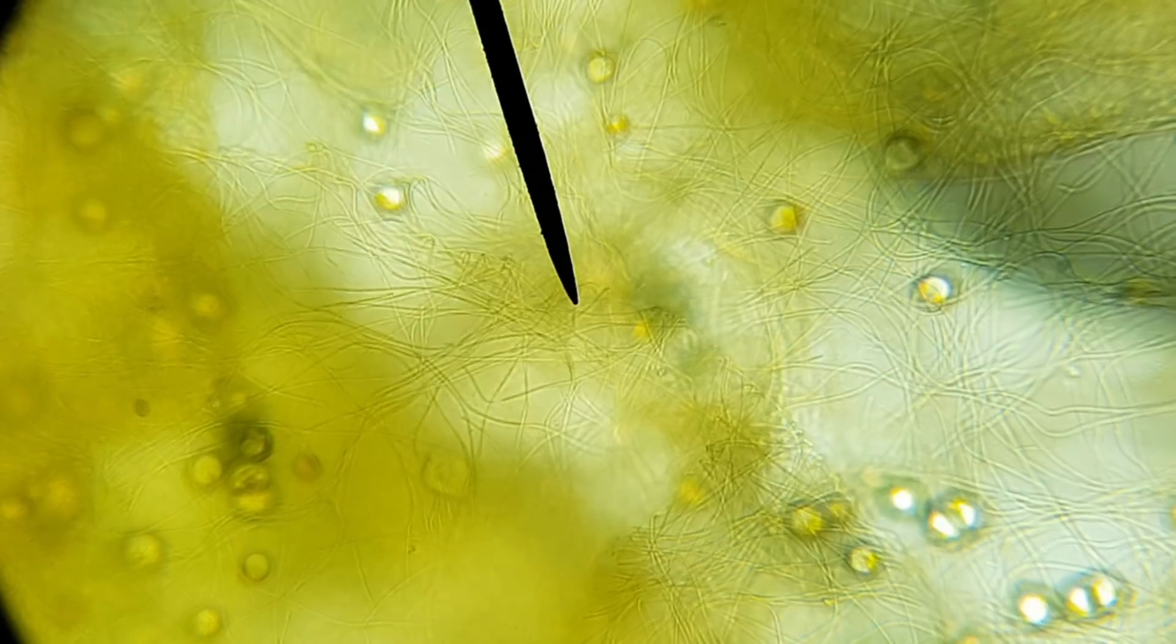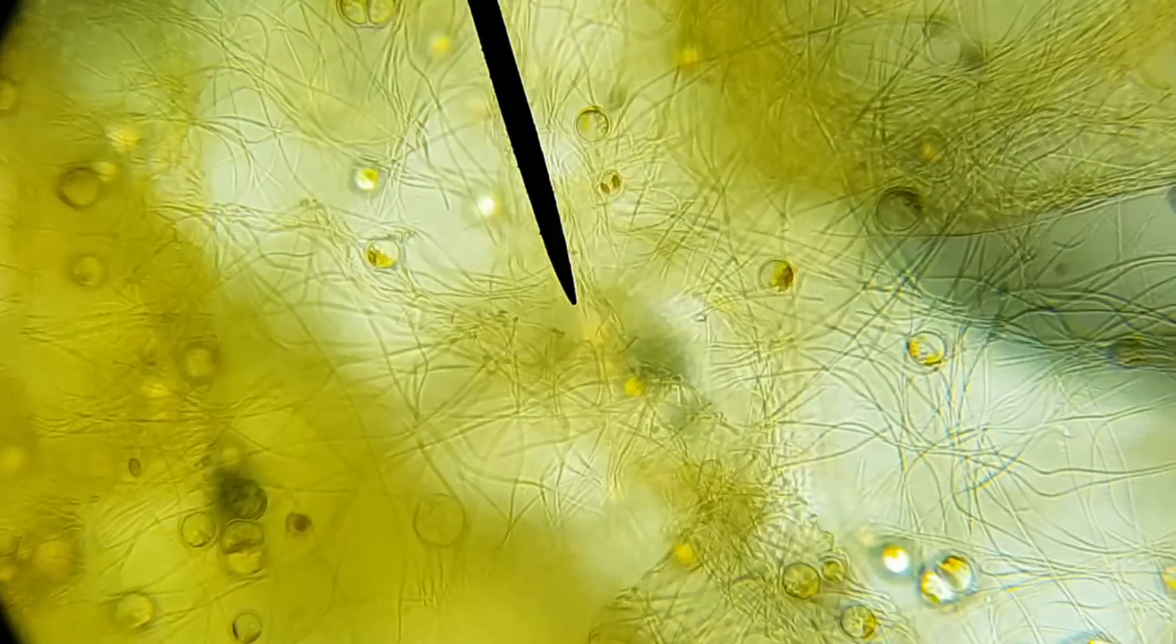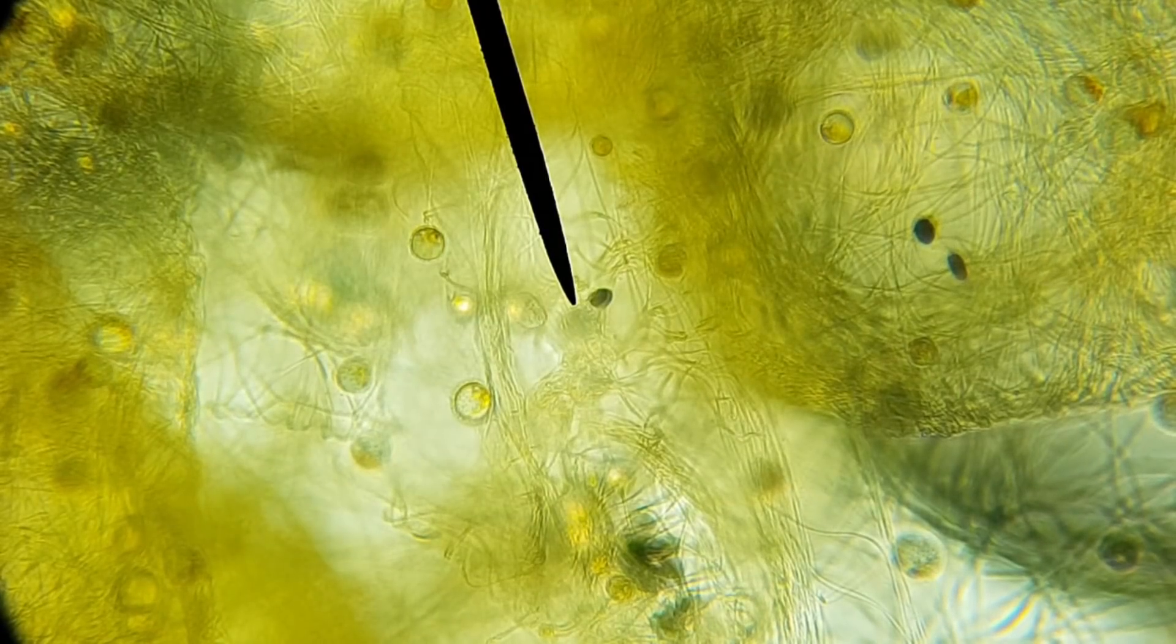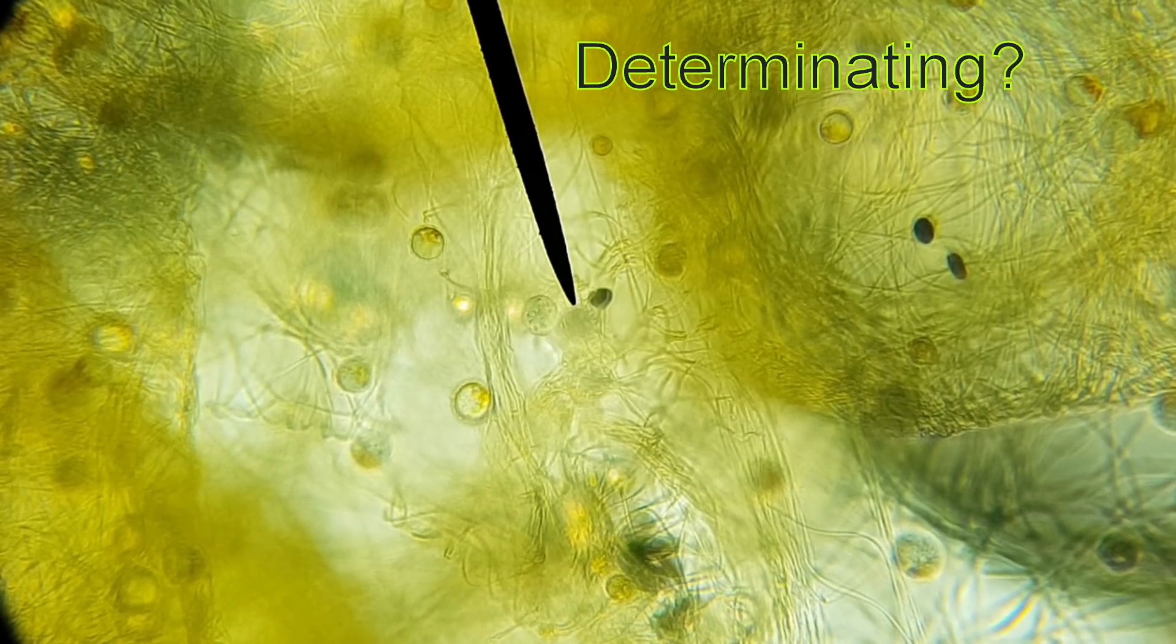So as I was saying, I saw two microorganisms. This is some sort of ciliate, which is about as far as I dare to go to terminating it.